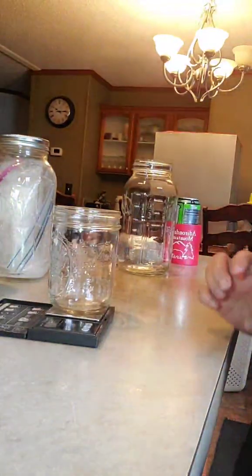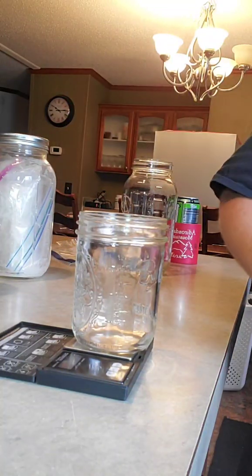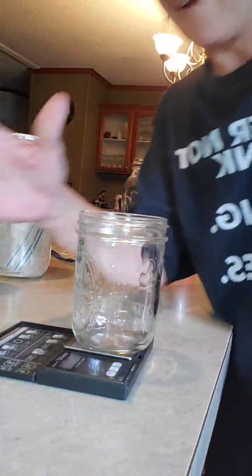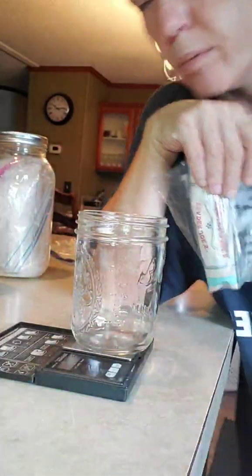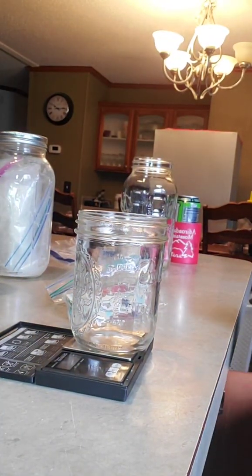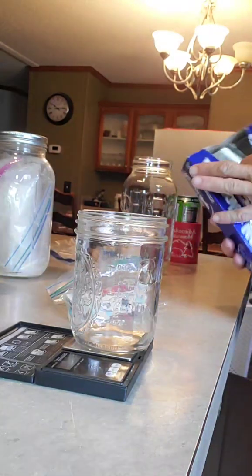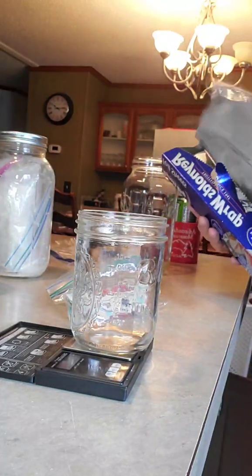So, we're going to work on agar. I'm going to try to get this camera set up. I may have to take it off and put it back on. Okay. The things that we're going to be working with are, and by the way, I've already got my pressure cooker set up. My lids are ready to go. Forgot my tinfoil sheets though. Hold on. Where are you, my tinfoil sheets? Found you. Everything should be ready to go.